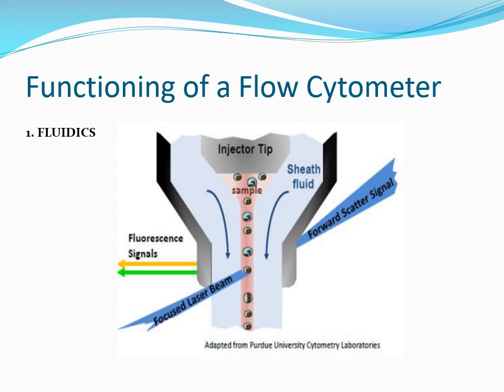Now this introduction of a large volume into a small volume: here the volume is large, and over here the volume reduces because of the diameter of the fluidics system. This results in focusing, or single filing, of the sample cells. This compresses the cell stream into a diameter of one cell, and this is hydrodynamic focusing. So how can cells be made to flow in a single line?